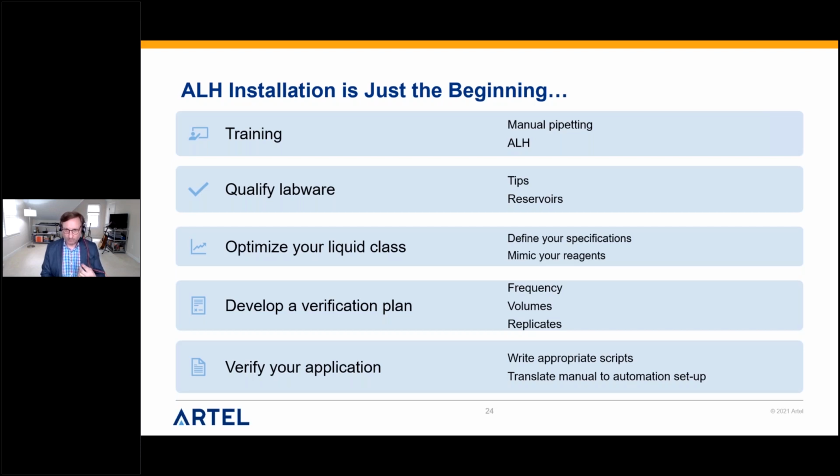And the reason manual pipette training is important, I've seen so many cases where the automation is working fine, but that manual to automation transfer fails because of variability issues and accuracy issues. And there's been so many cases where it translates right back to that manual pipetting. The person was doing it in some weird way, and the assay was working for them, but then when it was automated, that's when the problem became apparent. So again, make sure all pieces are working properly before assigning blame.